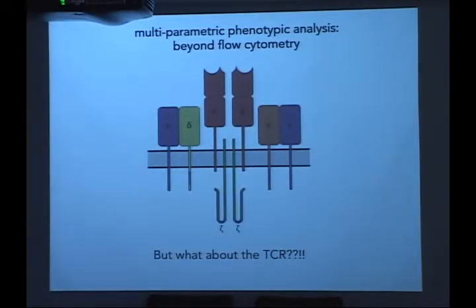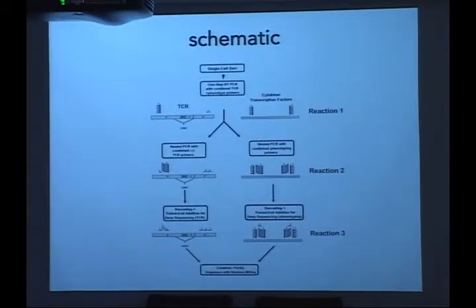So this is basically an outline of the technology I've developed. I apologize, I didn't develop some fancy machine that vaporizes cells and does mass spec or pipettes obscenely small volumes with high accuracy. It's really quite simple, and I think that anybody in this room with marginal training could learn how to do this. The first aspect we developed is a TCR sequencing part.